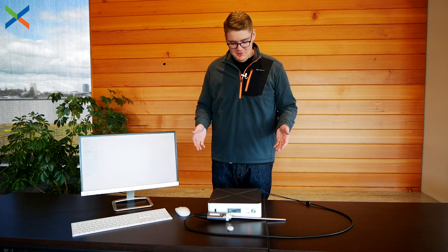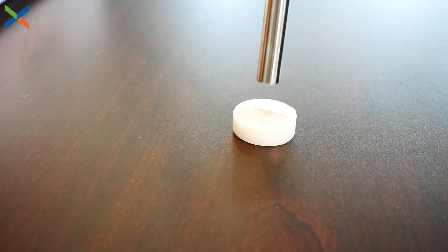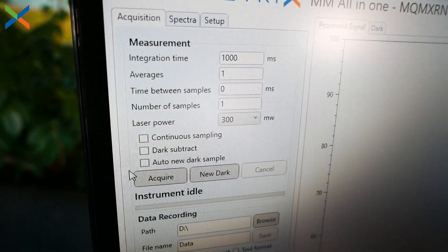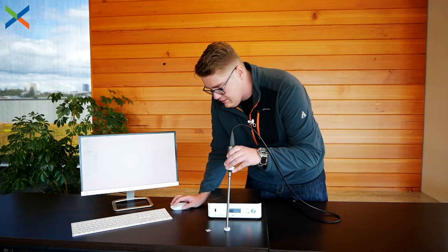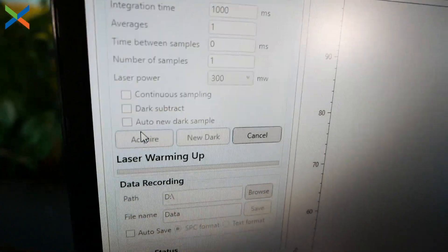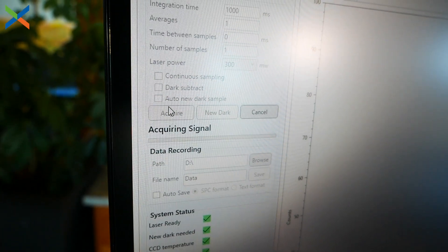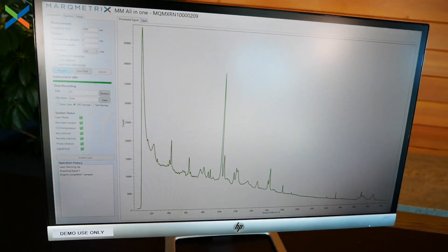We have everything plugged in, the device is up to temperature, and it's time to take our first sample. Make sure you are touching the end of the probe to whatever it is you're trying to sample — in this case, we have a couple small pieces of plastic. Make sure all of your different measurement parameters are set correctly; this will depend on what you're trying to measure, and you can contact us if you need help with these settings. Then go ahead and hit acquire. You'll see a progress bar on the left side of the screen, and there you go — you have your first spectrum in no more than about 15 minutes.